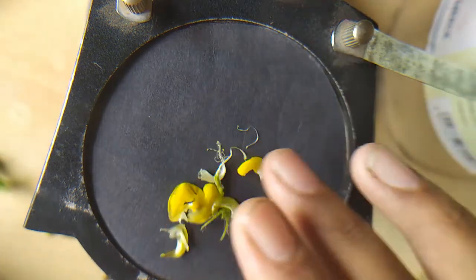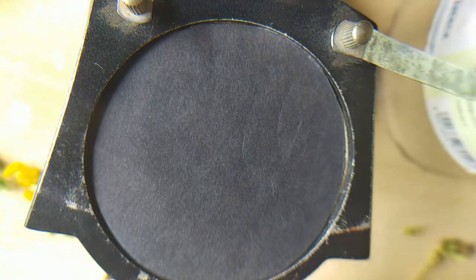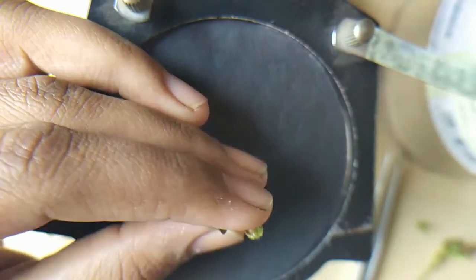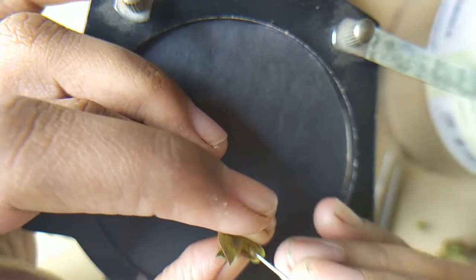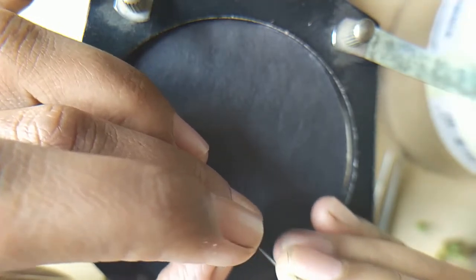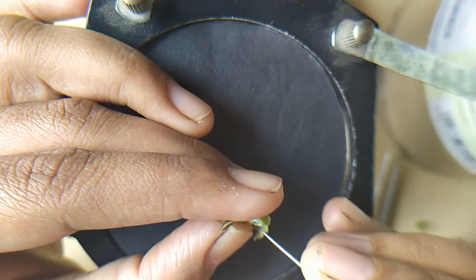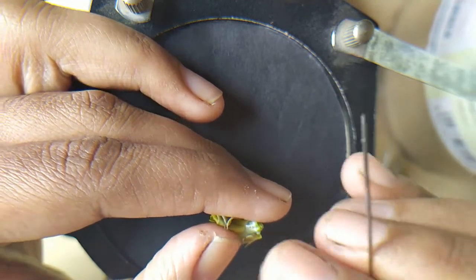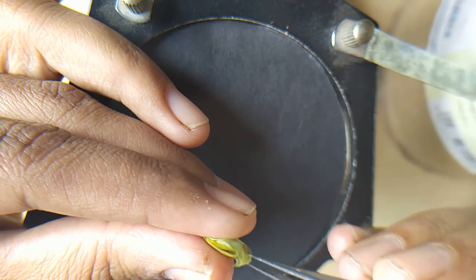Thank you. Now we start the dissection of the green gram flower, the same as in the case of urad bean. Give a vertical cut, then give a round cut to your calyx and remove it from the base of that flower in fused condition.